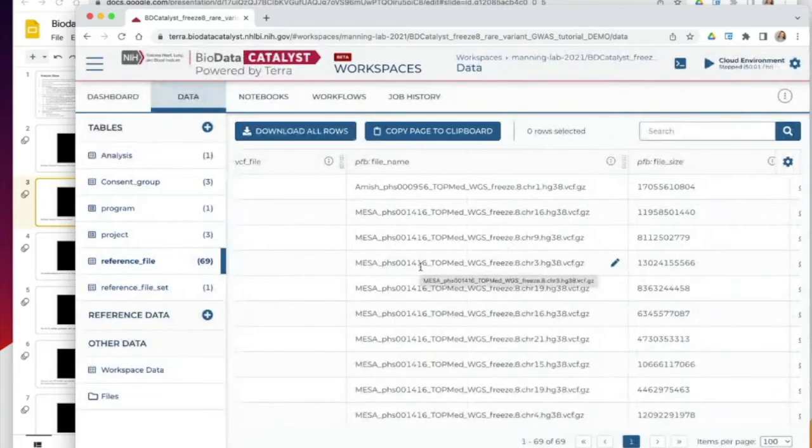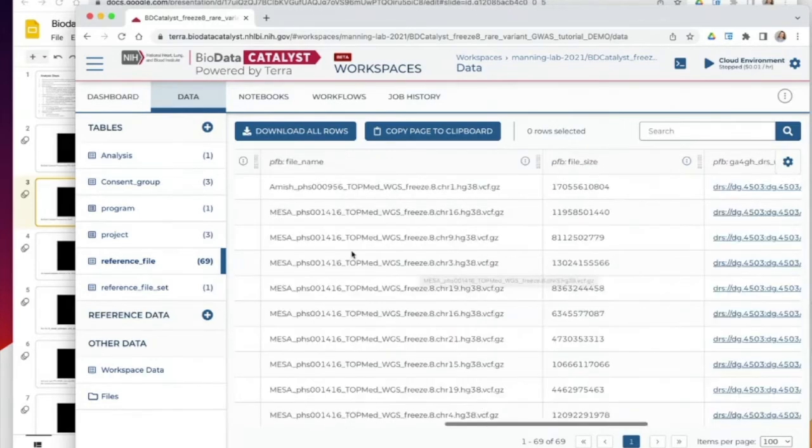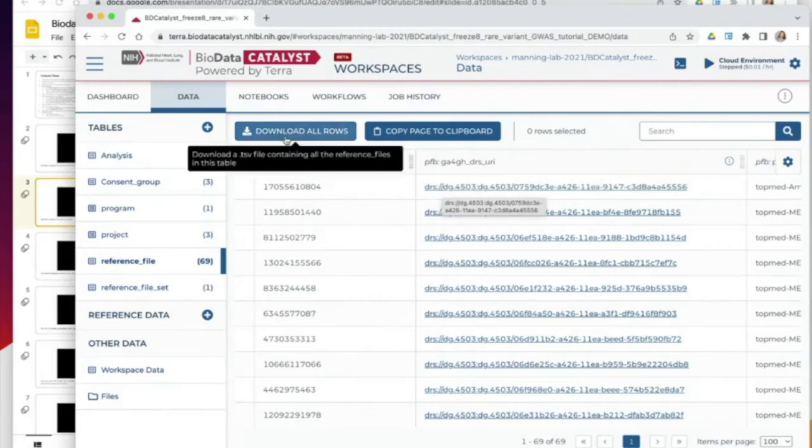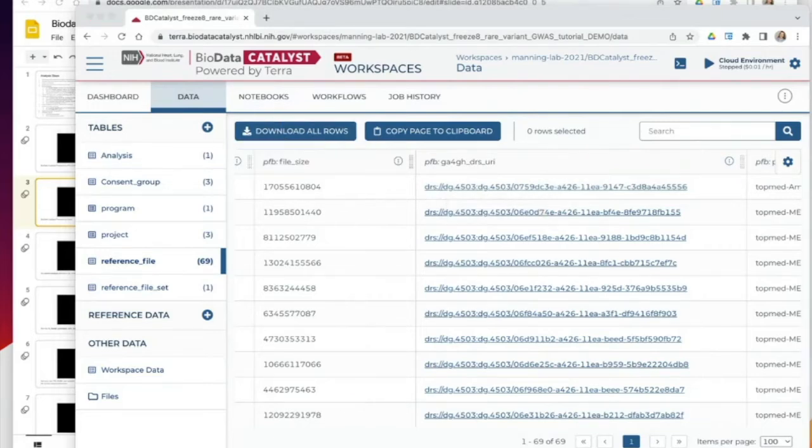Okay. The next thing I'm going to show is how a person gets to be authenticated in such a way to use a file like this DRS URI, this file link, in an analysis. And now what I'm going to do is show you guys dbGaP.